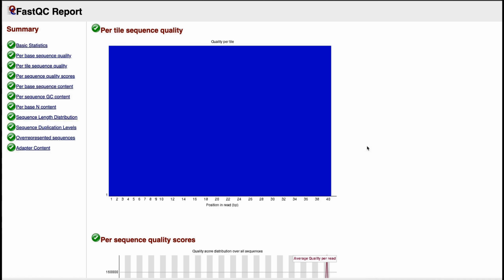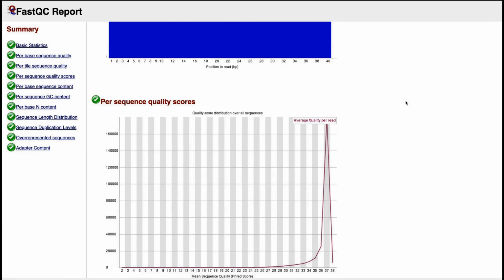This is the picture which in the bad case scenario shows some scratches and defects of your flow cell in the Illumina machine or other machine, which means that something is not exactly good. Ask the technician and maybe they can fix it, but when it is empty it means it's alright.